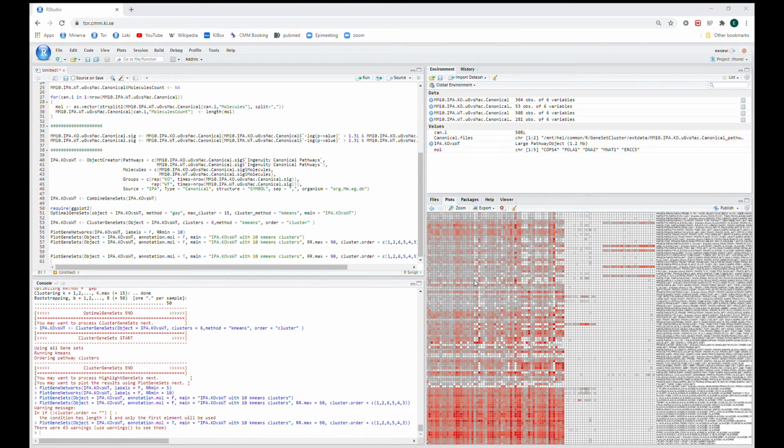But basically you can see for every gene set, what are the genes enriched, and then you can see, oh, these are extremely the same, and they have a very high overlap, and the pathway. In this case, there's so many of them, you can't actually see it very easily. So when you write it to PDF, you can play around with the sizes and fonts, and it's much more legible.